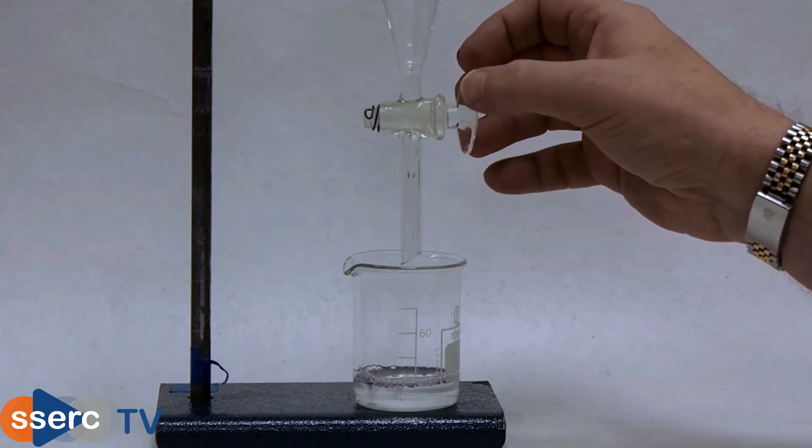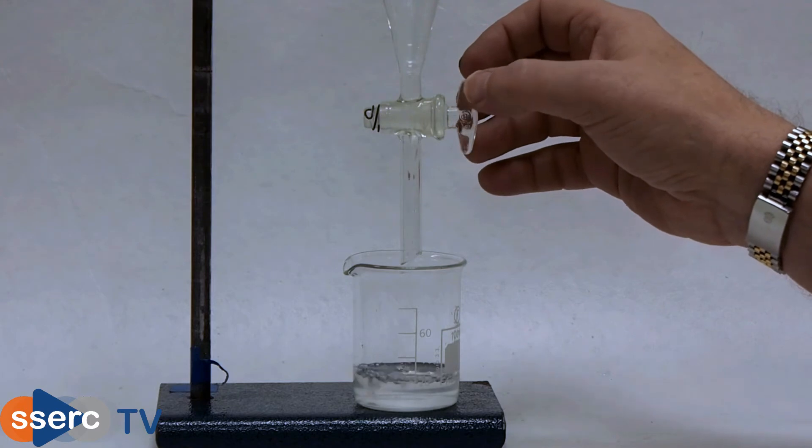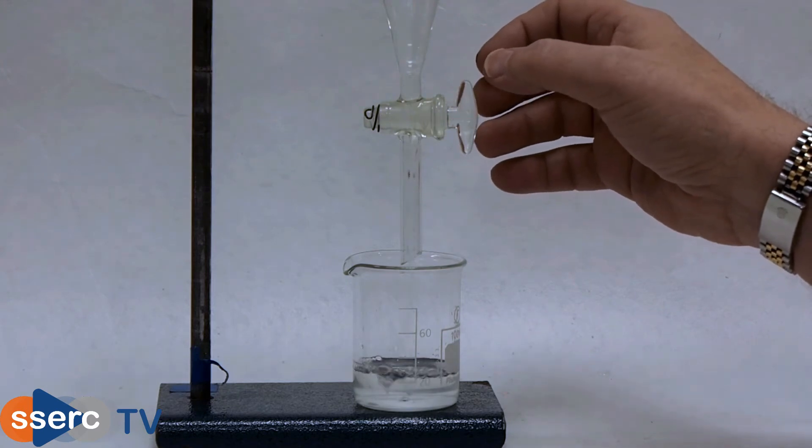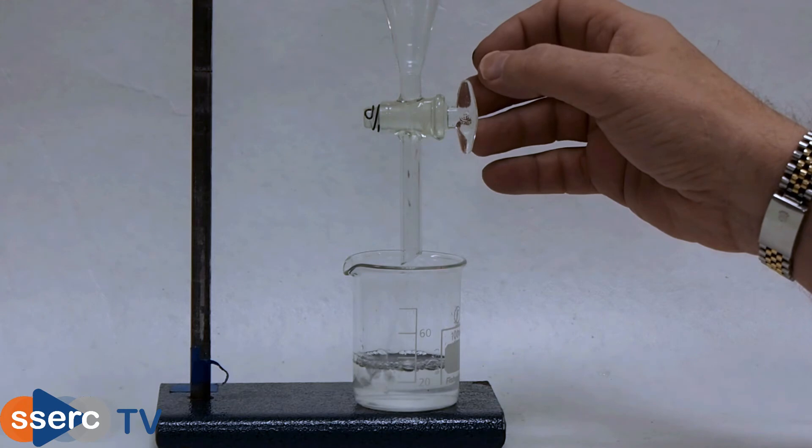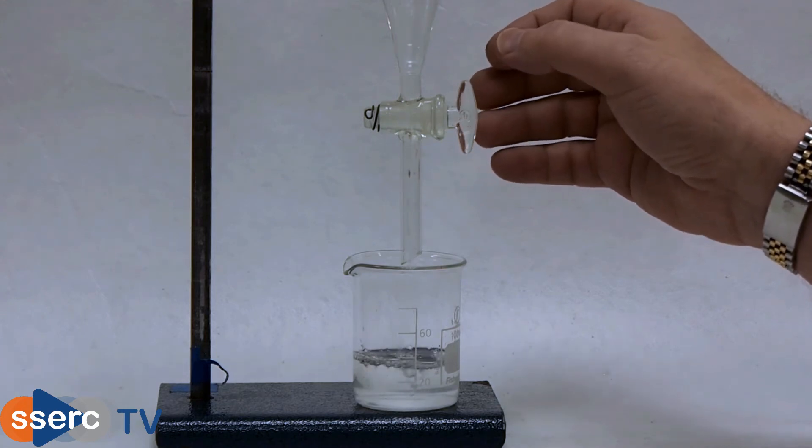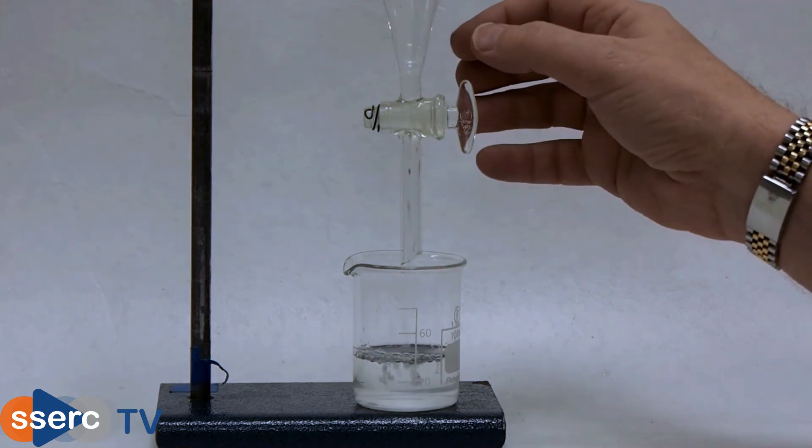Make sure you know which layer it is that you need. In this case we need to keep the top ethyl ethanoate layer. This has the caffeine in. However, it is important not to simply dispose of your aqueous layer.